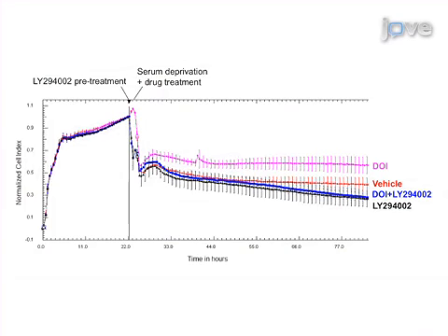The main advantage of this technique over existing methods, like endpoint neurotoxicity assays, is that it allows cytoprotection and cytotoxicity to be evaluated in neuronal cell lines in real time and under label-free conditions.